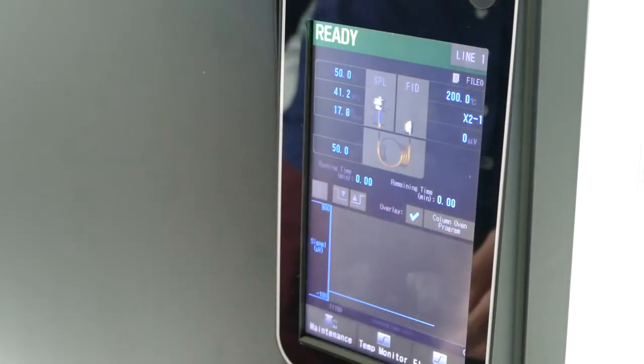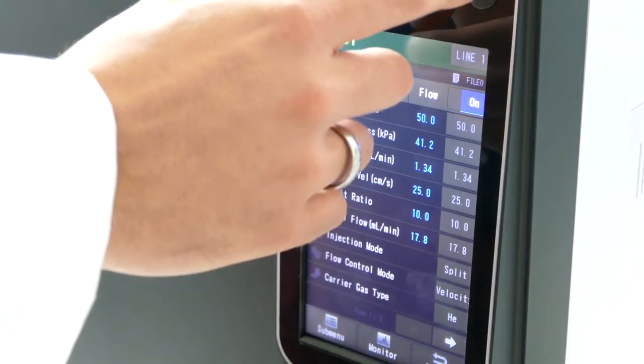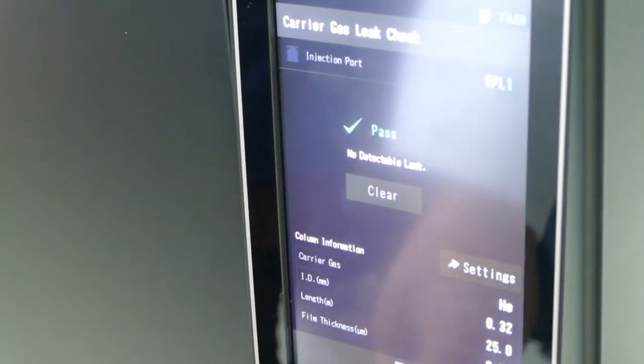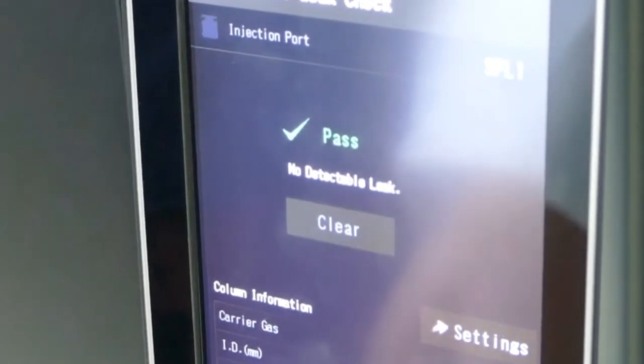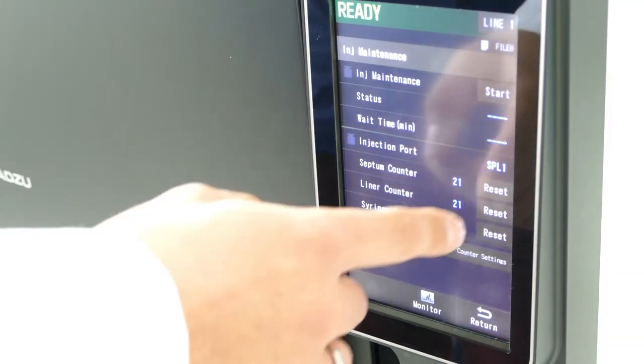To check the system is leak tight, activate the gas flow and check if the injector pressure remains stable. Alternatively, you can start the automatic leak check utility. After the maintenance is complete, the counter for the septum and the liner can be reset.